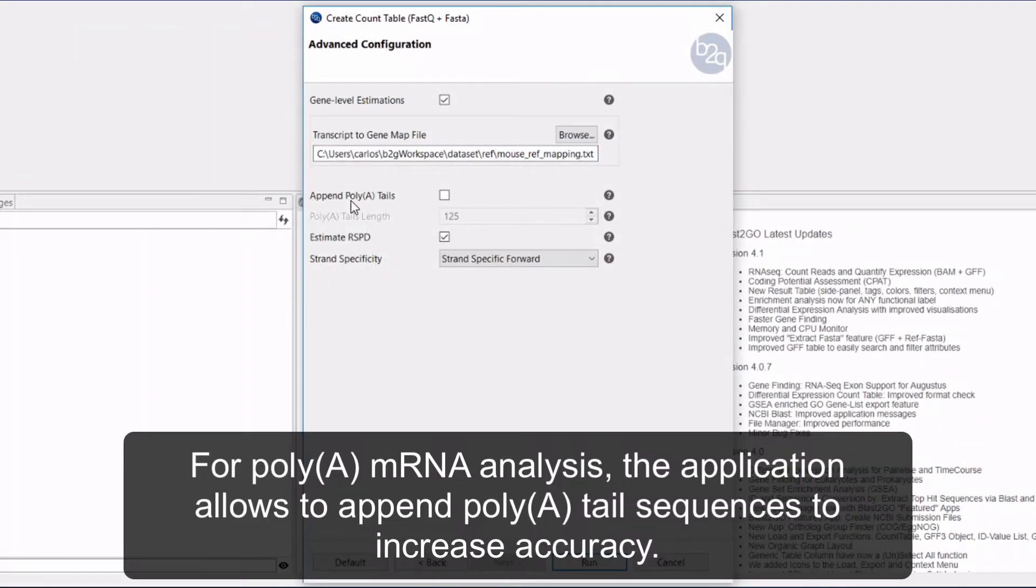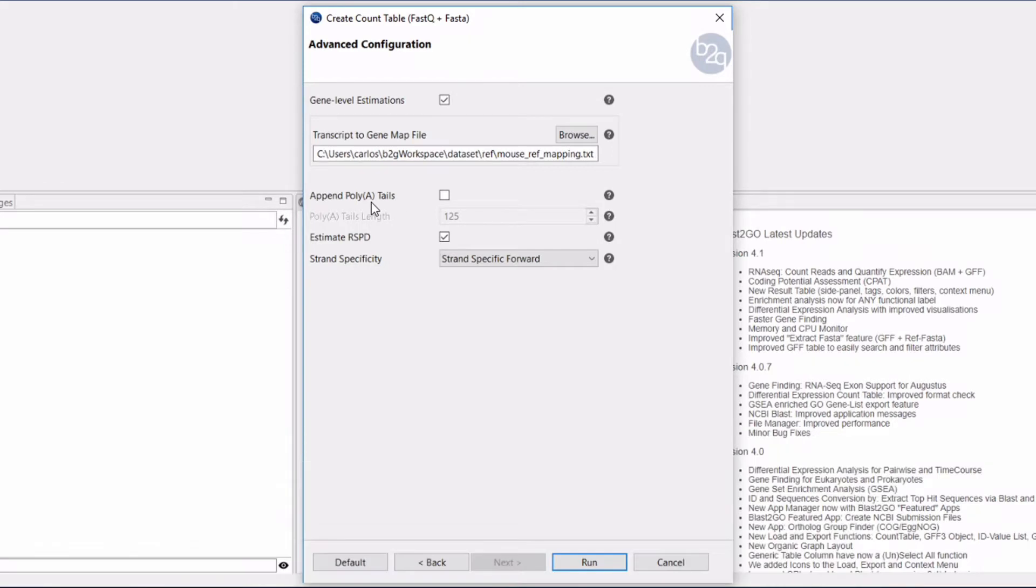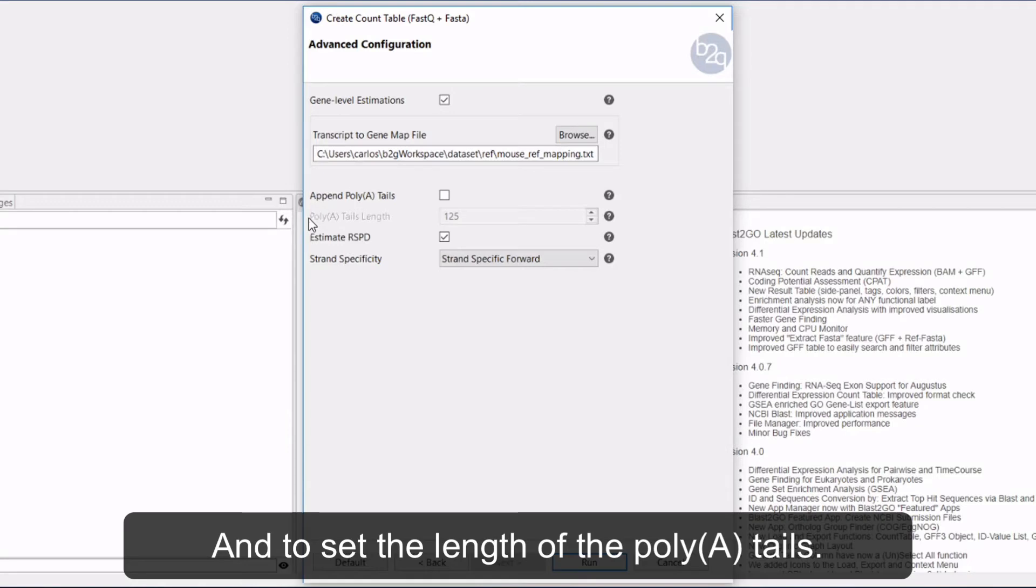For poly-A mRNA analysis, the application allows you to append poly-A tail sequences to increase accuracy and to set the length of the poly-A tails.